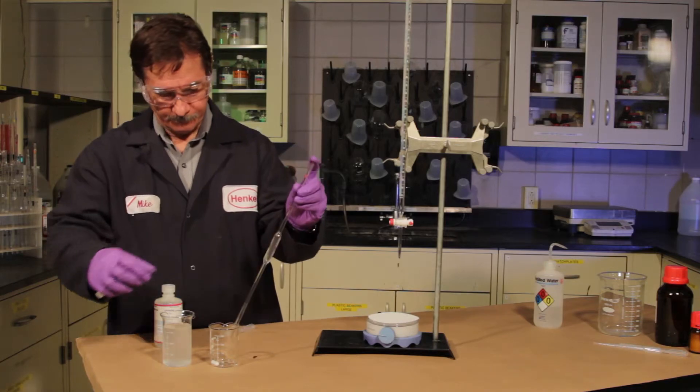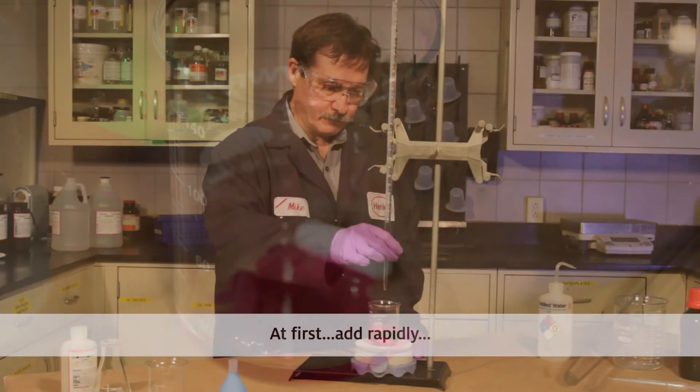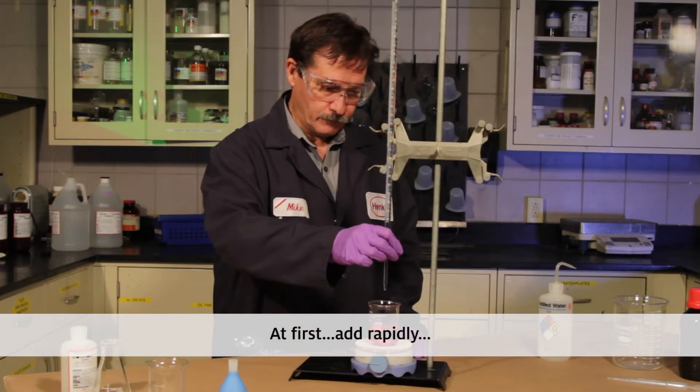Now that we have a measured sample of our bath and have added the recommended indicator, let's add some titrant. At first, we can add titrant rapidly.